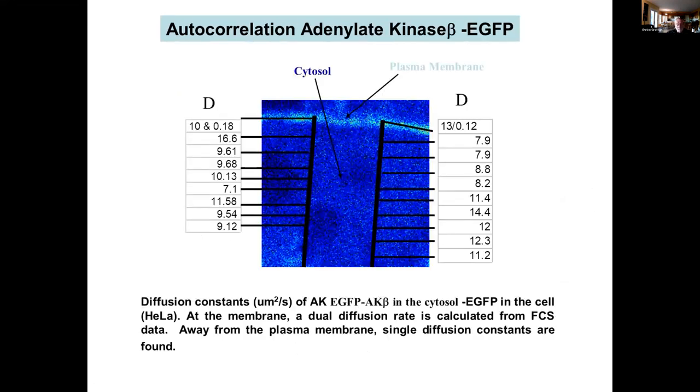But the problem is a little more complicated than that. And this is the experiment I asked my student to do. So this is the membrane, and it's about 5 nanometers, what you cannot see from this figure. But if you measure in this point, you get 2 correlation times. If you measure in this point, you get 1 correlation time. But if you look at those numbers, all those numbers are different. Which means that there has to be something different in the different positions of the cell.